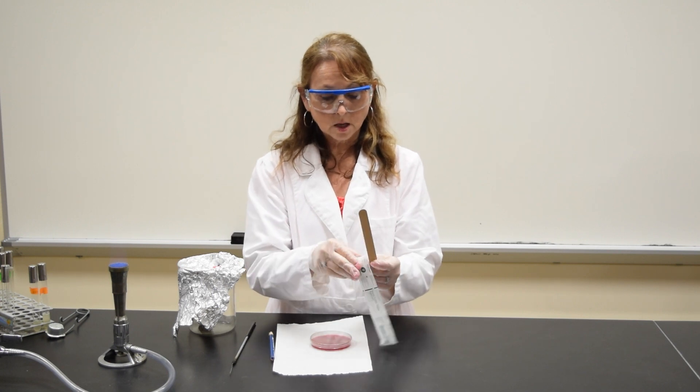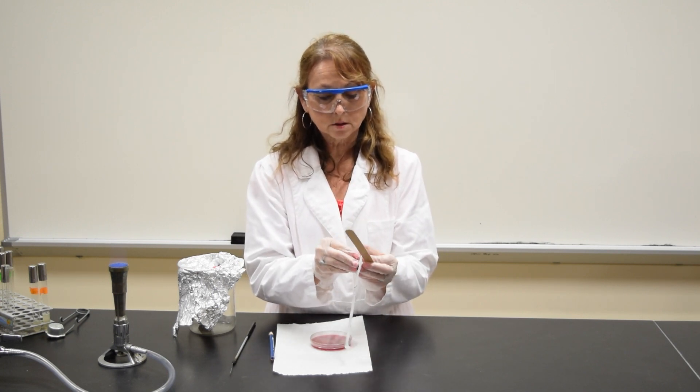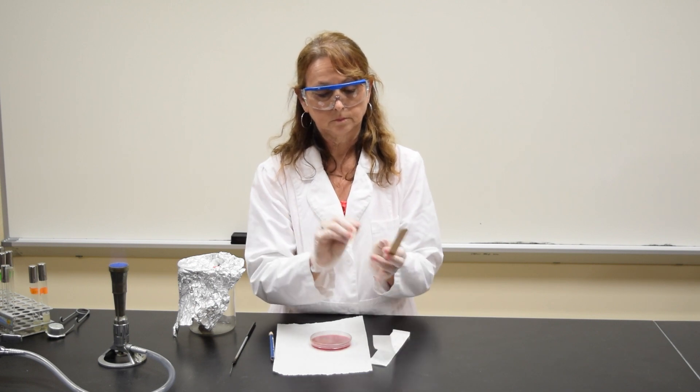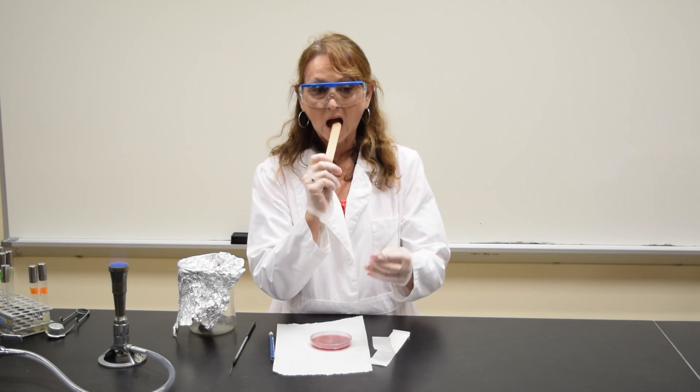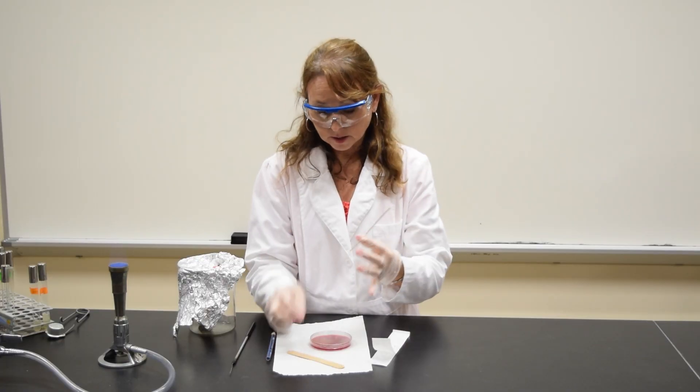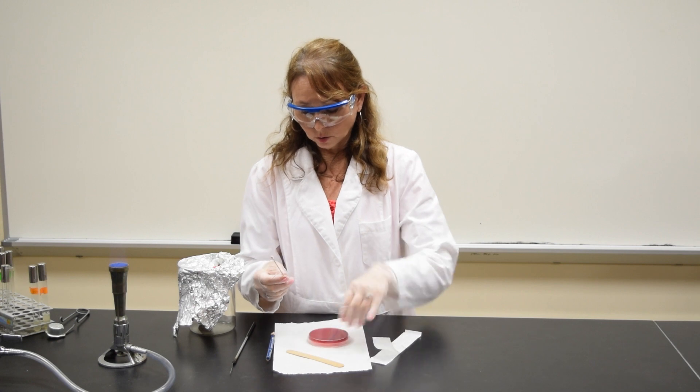As you hold down your tongue with the tongue depressor, you're going to be collecting your specimen. You want to touch the back of your throat or your uvula.